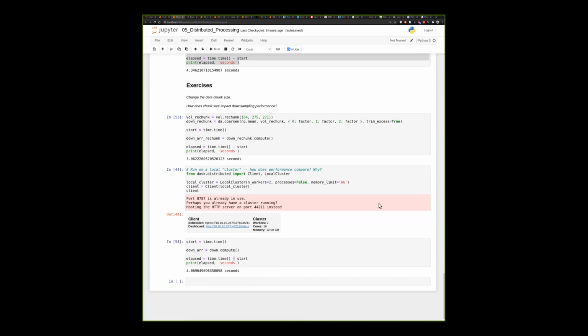If anyone tried the chunking, here's an experiment with changing the chunk size from how it was stored natively and increasing it. Before, we just had one slice, and I changed it from 1 to 64, so it's a larger chunk. Even for this simple operation, that seemed to improve performance consistently.